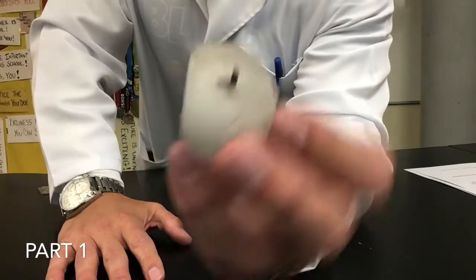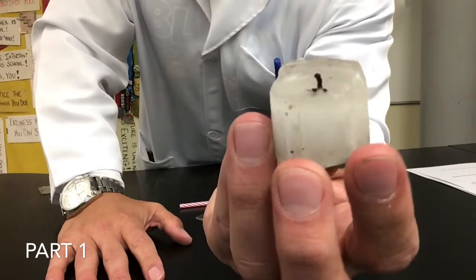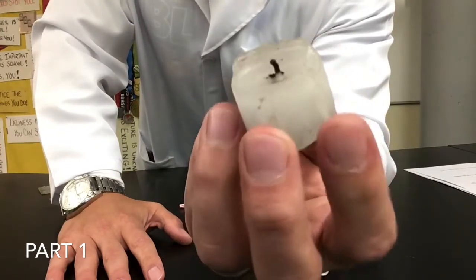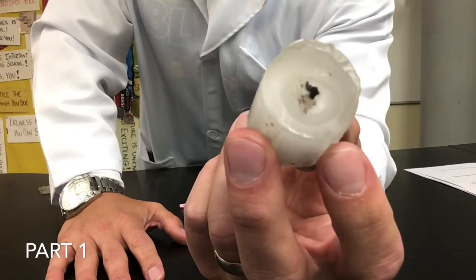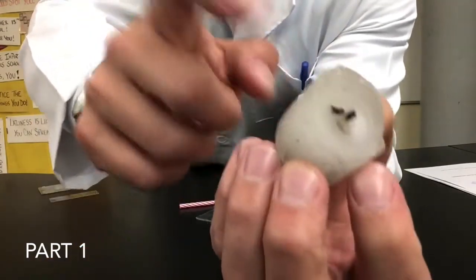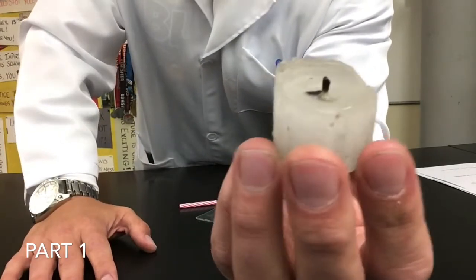The last part then is, what state, physical state, is this candle in right now? Remember, the three states of matter are solid, liquid, and gas. So when you look at this, this is simply just a solid candle. So make sure you write that down as well and be clear.